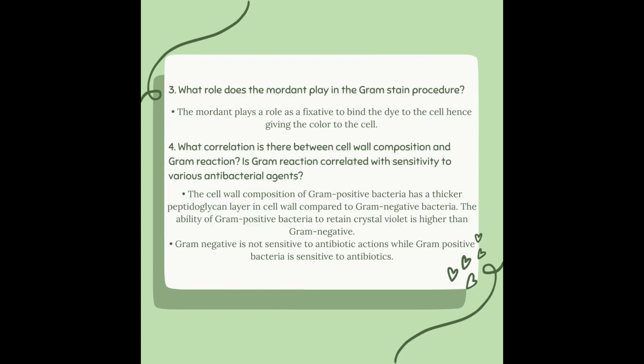Question number 3. What role does the mordant play in the gram stain procedure? The mordant plays a role as a fixative to bind the dye to the cell, hence giving the color to the cell.